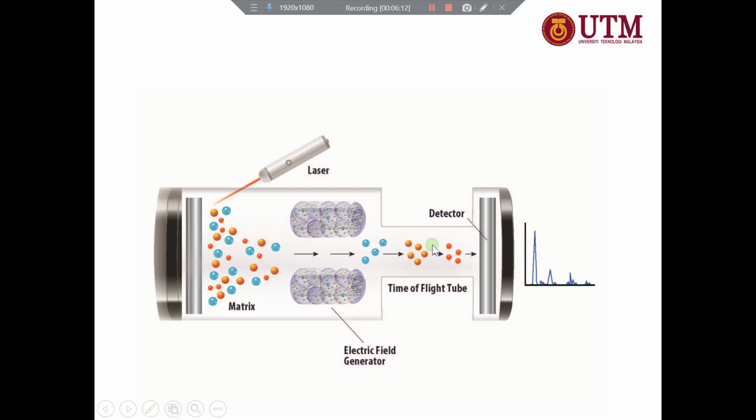When the analyte has a positive, cationic charge, it creates potential energy that gives the signal. An analyte that is negative or neutral, or just solvent, will not create potential energy at the detector, so it will not react. That's how it actually happens.